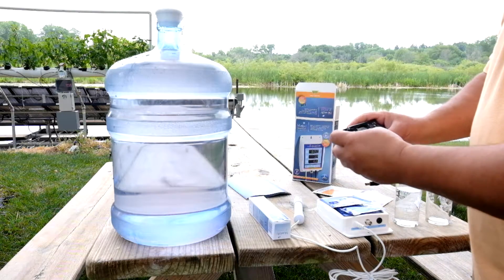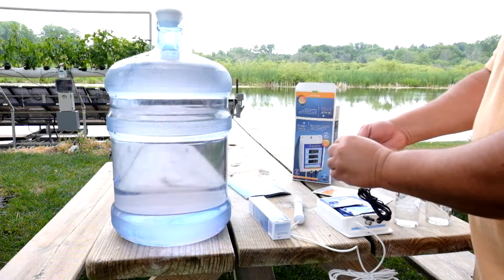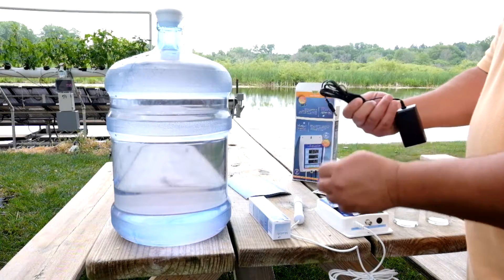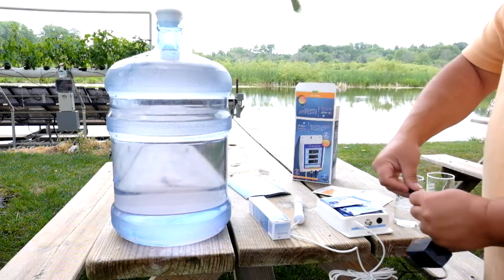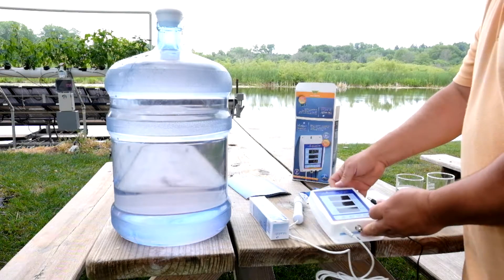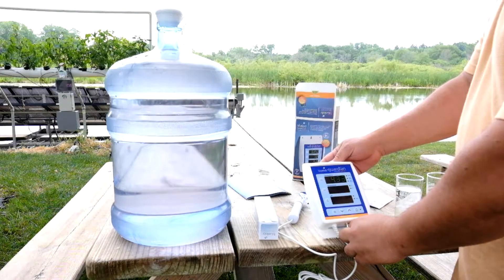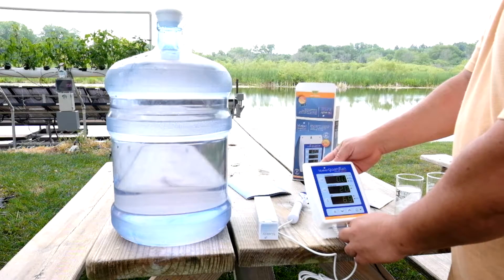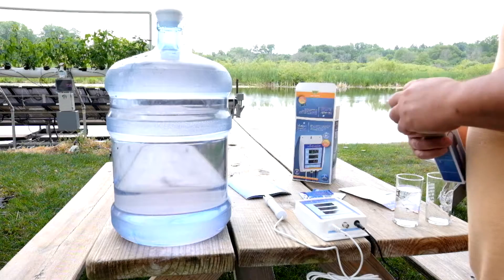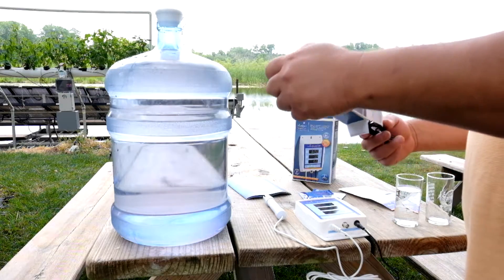This monitor also has a USB dongle that you can plug into your computer to pick up some basic information. I was hoping it would have been a little more elaborate, but it's a pretty basic connect system. All you really get to see is what's currently on your monitor. You can't even change your TDS to PPM or your temperature — it's basically pretty much set, and it reads I think every 15 minutes. It's very basic. It does have local and cloud data logging capability.